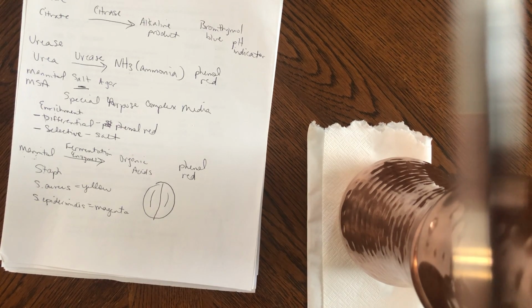All right, let's do the chemistry for the blood agar plates. So you'll have already seen the PowerPoint lab lecture on blood agar. Remember that it is an enrichment media because it's enriched with red blood cells, live red blood cells. And it's also a differential media in that you can differentiate the type of hemolysis which is displayed. Hemolysis is the act of digesting or lysing the red blood cells.